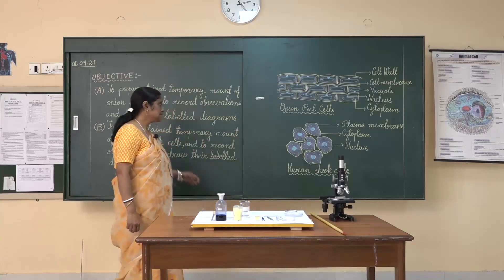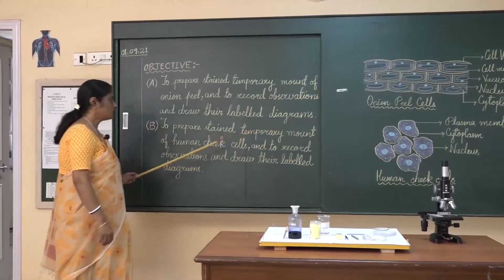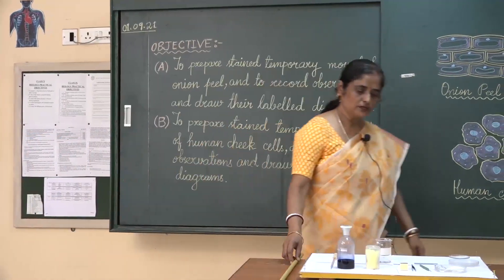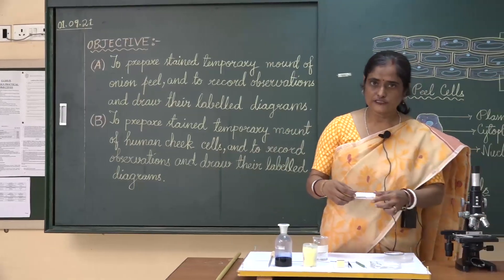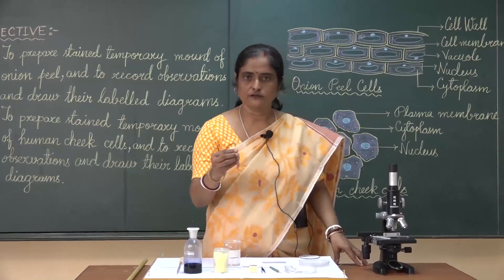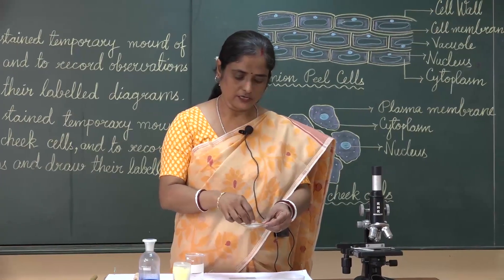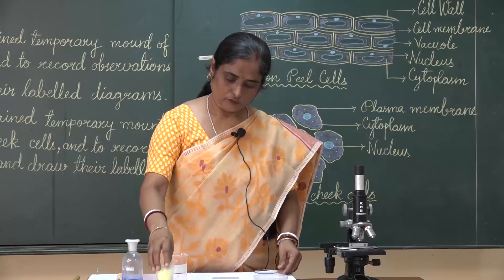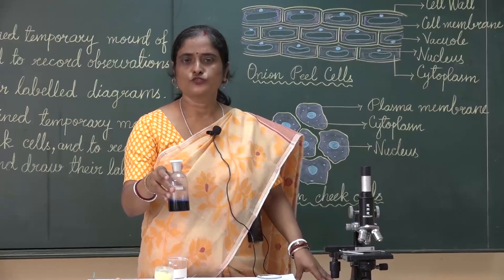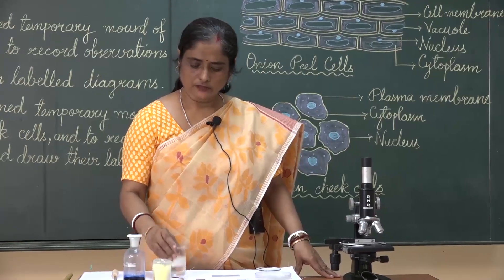Let us continue with the second part of the same objective — to prepare a temporary mount of human cheek cells and to record observations and draw their labelled diagrams. For this we need a slide, a toothpick, thin cover slips, and a stain. This time the stain is methylene blue, used to stain animal cells. A dropper and water are also required.